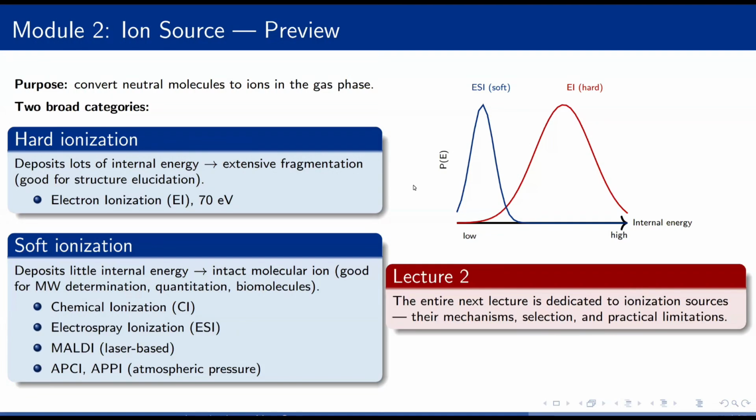Since ESI and MALDI, we can routinely measure intact mega-Dalton complexes. Entire fields, proteomics, metabolomics, depend on it. We'll do the details in the next lecture. For today, just hold the hard versus soft distinction in your head.